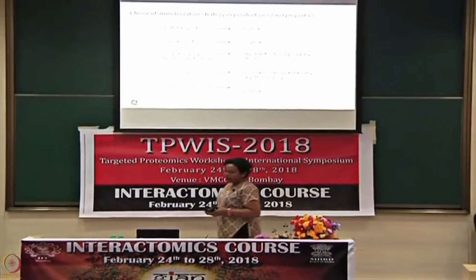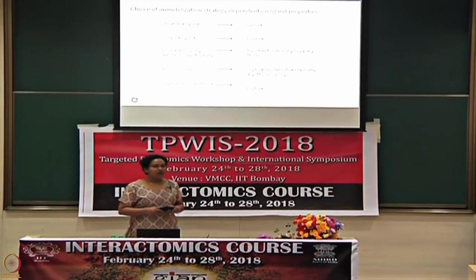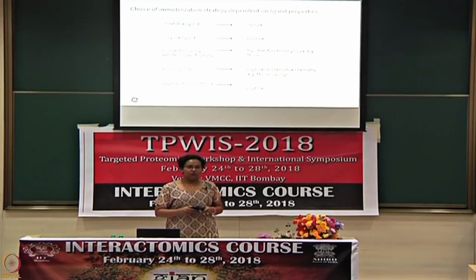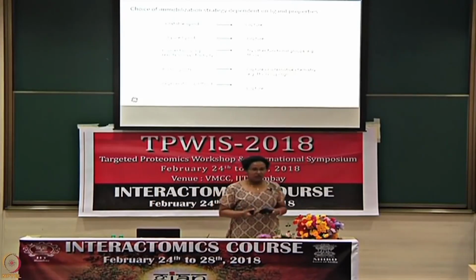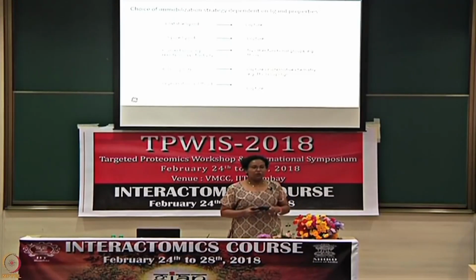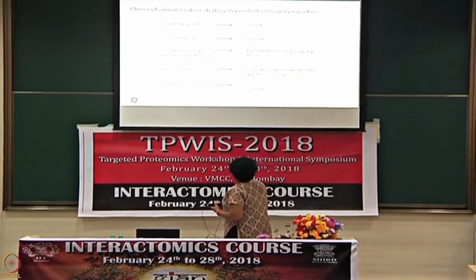Okay. Choice of immobilization strategy will depend on your ligand again. Amine coupling is very widely used; in most cases, more than 90% of the cases, we typically use amine coupling, particularly for proteins, because there is a huge amount of amine groups available in most proteins.